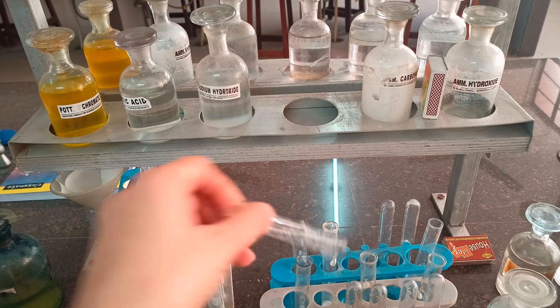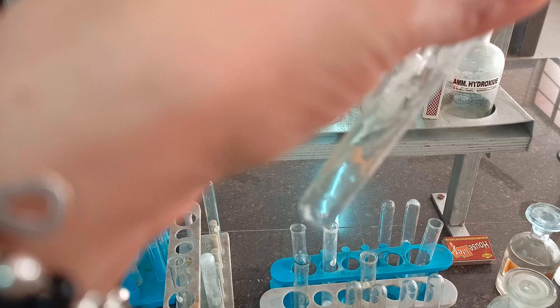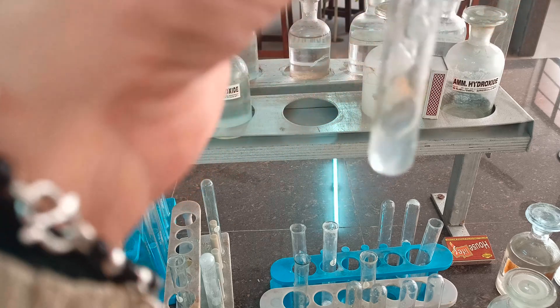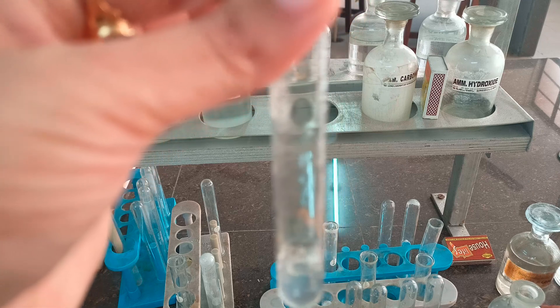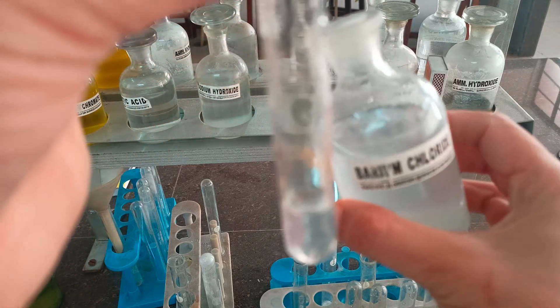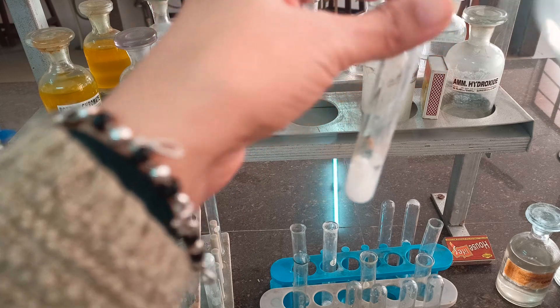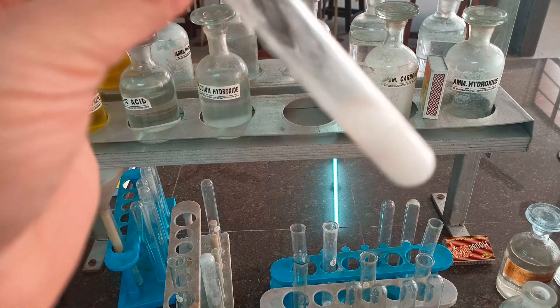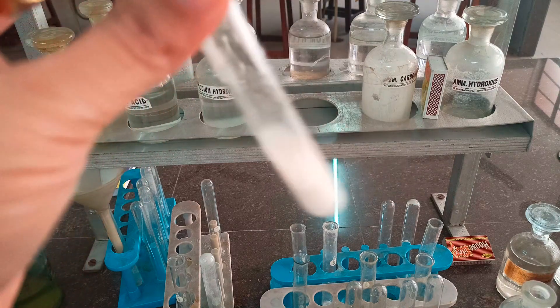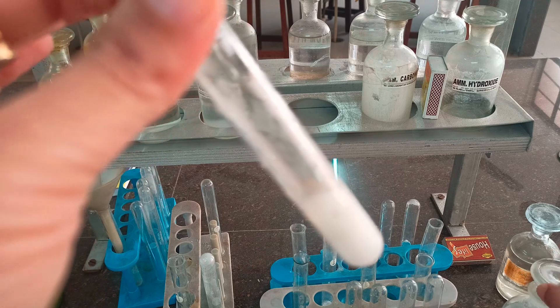For the second confirmation, we are taking another small part of the aqueous solution and adding barium chloride. White precipitates of barium sulfate are formed, confirming the presence of the sulfate ion. We have now detected the acid radical as sulfate.